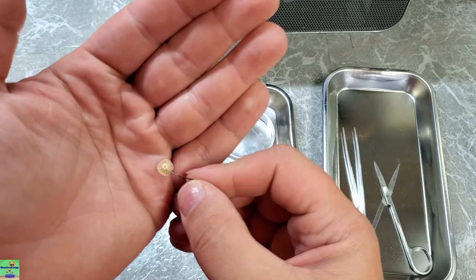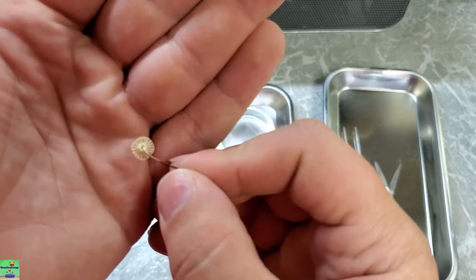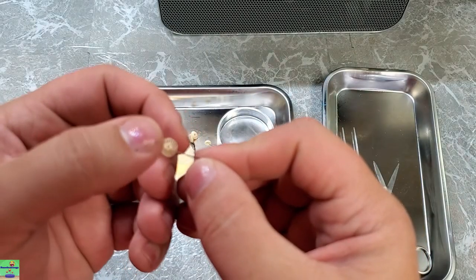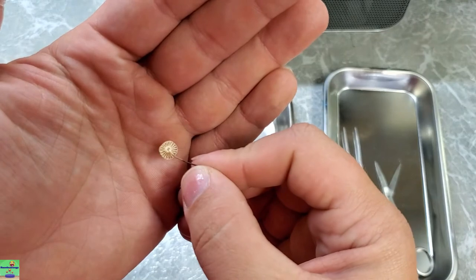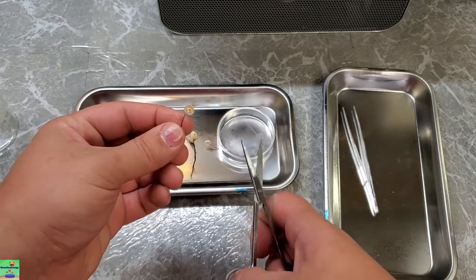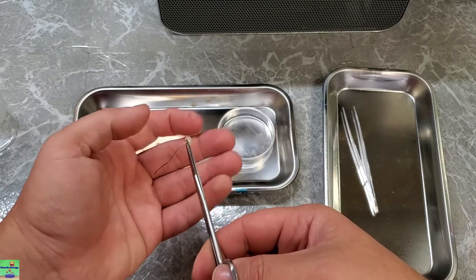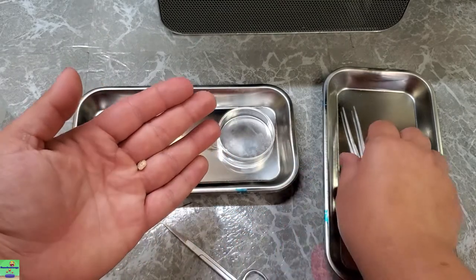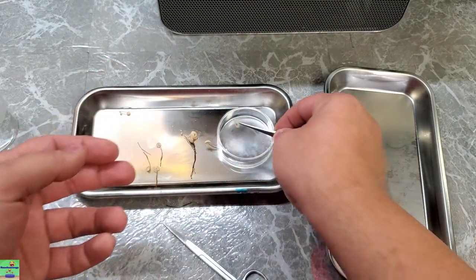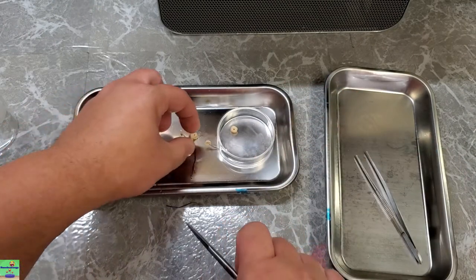And whenever you're taking a spore print of particularly a gilled mushroom such as this one, the spores are going to come out, obviously, of the gills. So all you need to do is snip this off, which is the stipe or the stem. We don't need that for a spore print. And then we're going to place this gill side down onto our clean vessel.